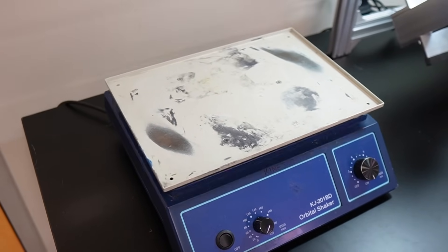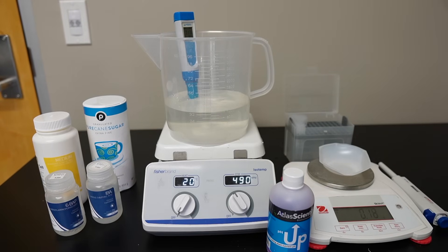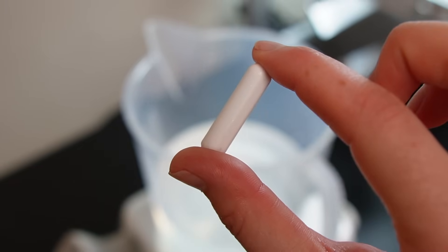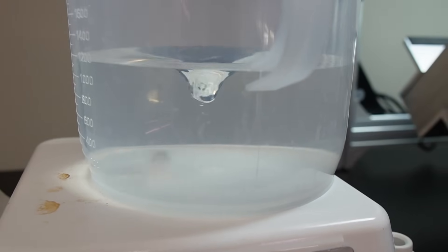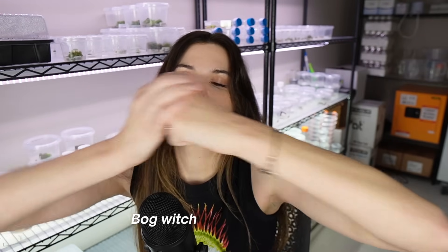The next two pieces of equipment that I regularly use for plant tissue culture are the orbital shaker and the magnetic stirrer. The Fisher Isotemp magnetic stirrer slash hot plate — I did buy brand new, which was around $900 when I was first getting started and didn't know better. I mainly use the magnetic stirrer for mixing tissue culture media, which is the gel that the plants multiply in. The magnetic stirrer uses a spinning magnet underneath the plate to make a small stir bar inside the liquid spin around, essentially mixing everything together — kind of like having a tiny motor inside the liquid. Bog witch cauldron style.